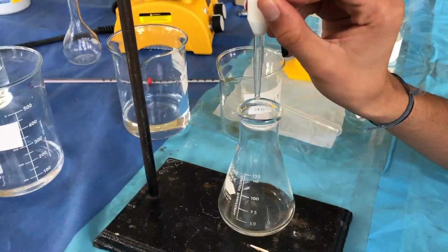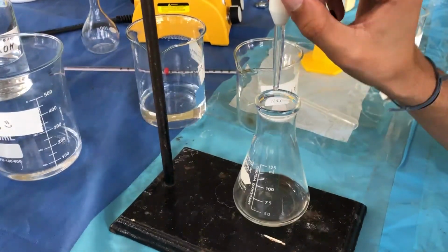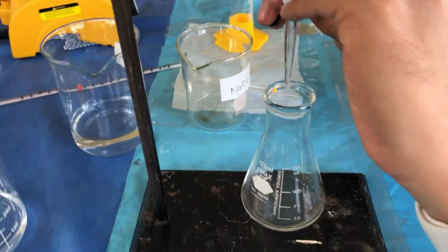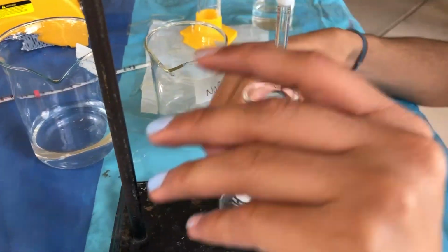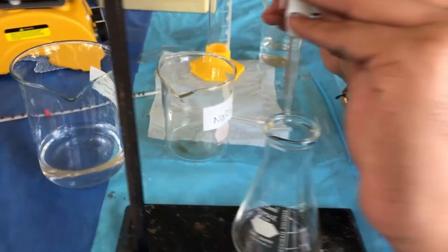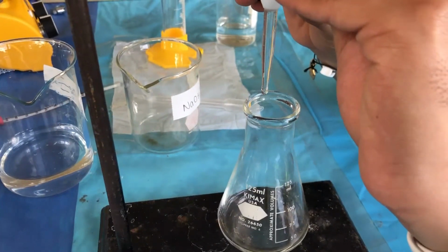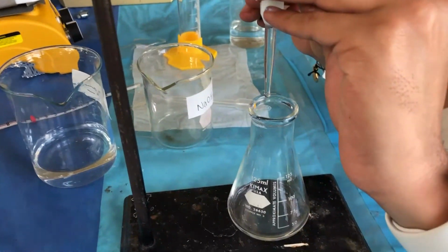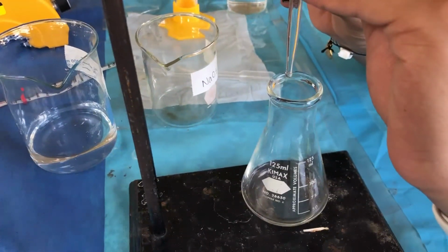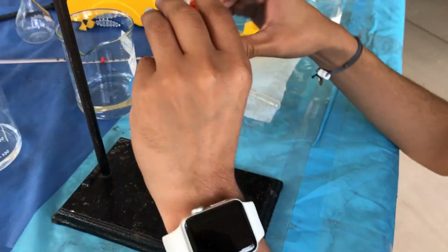Patience. So the goal is to get 1 drop and swirl. So 1 drop, he's going to swirl it. We do this to ensure that we don't go past the end point. And swirl. We'll continue this process until we start seeing a light pink.